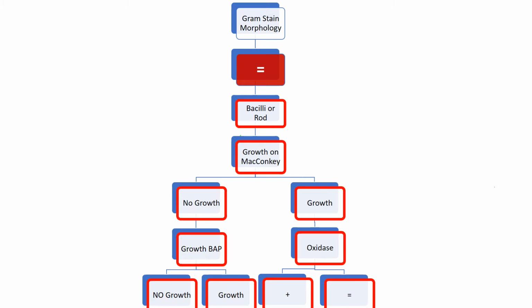Okay, so the routine primary culture media or setup that we call in the lab includes sheep blood agar or SBA. Sometimes we call it blood agar plate or BAP, MacConkey, and chocolate agar plates for most clinical samples. However, as you have begun to learn, there are certain organisms that require special growth requirements. So those special culture media will have to be added to the setup.